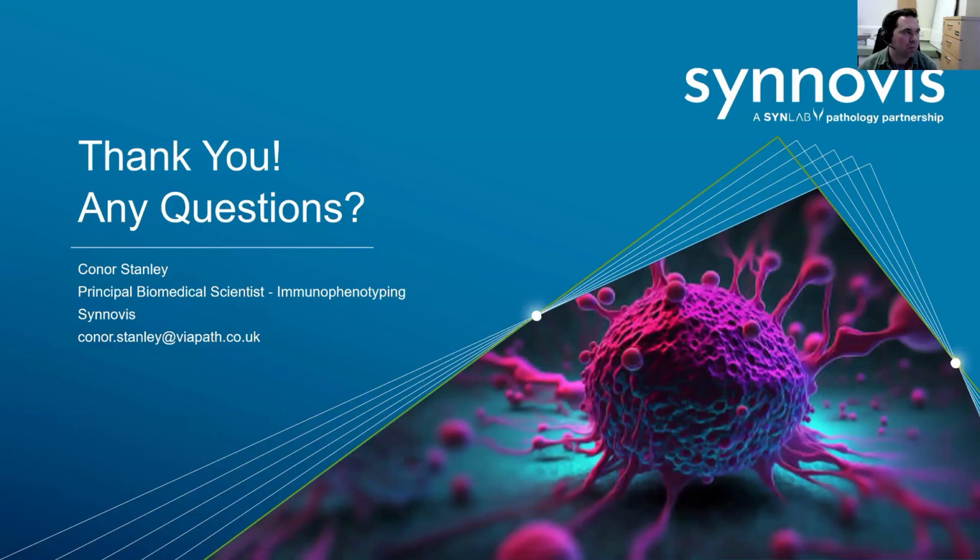In terms of setting up the other panels, I don't want to sound like a salesperson for Beckman Coulter, but they have now developed these Duraclone tubes that have all the antibodies built in, and you can just buy them off the shelf.